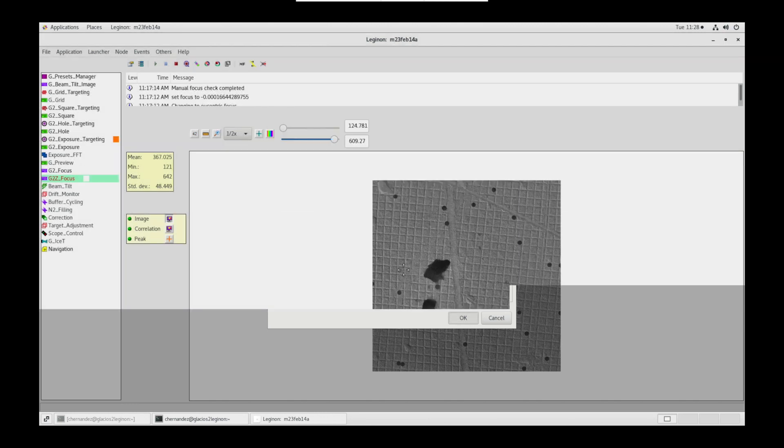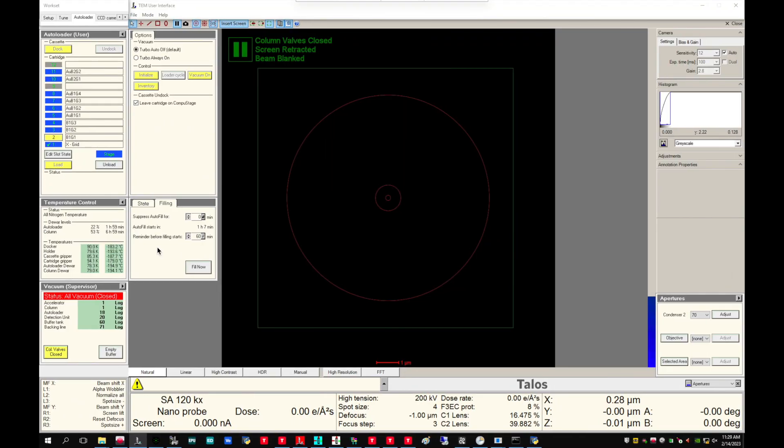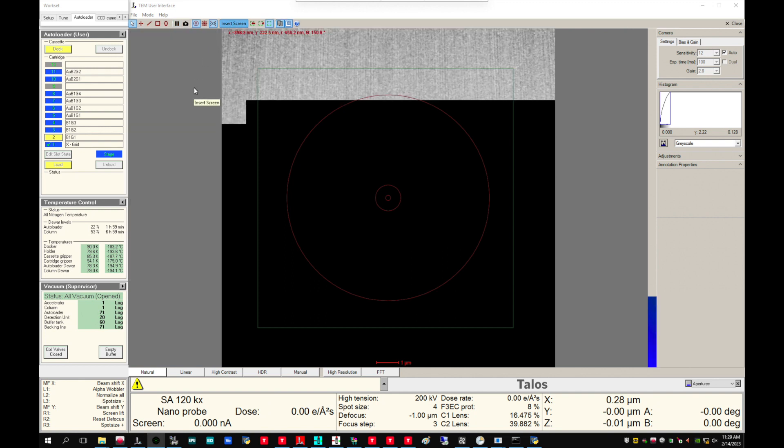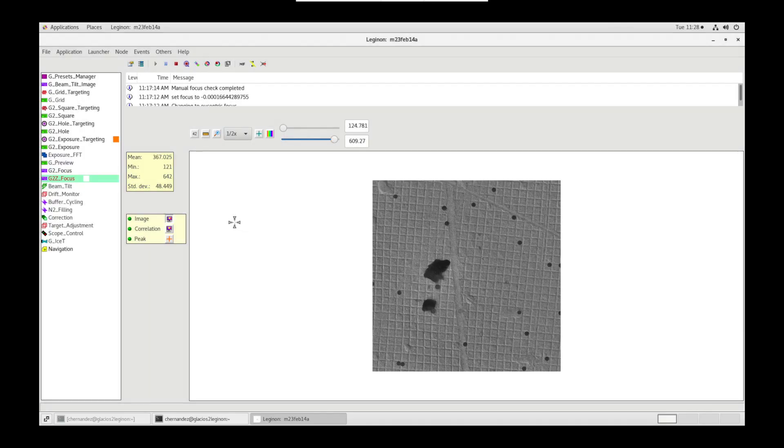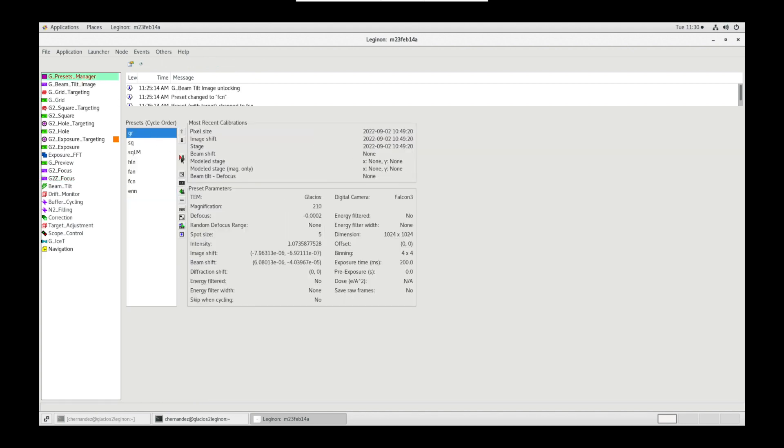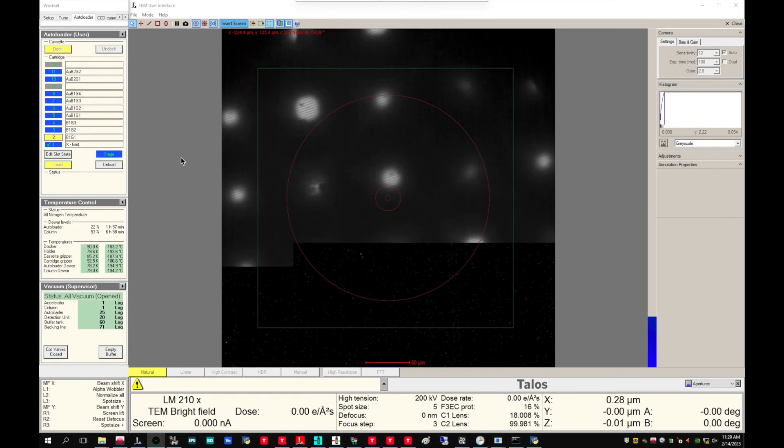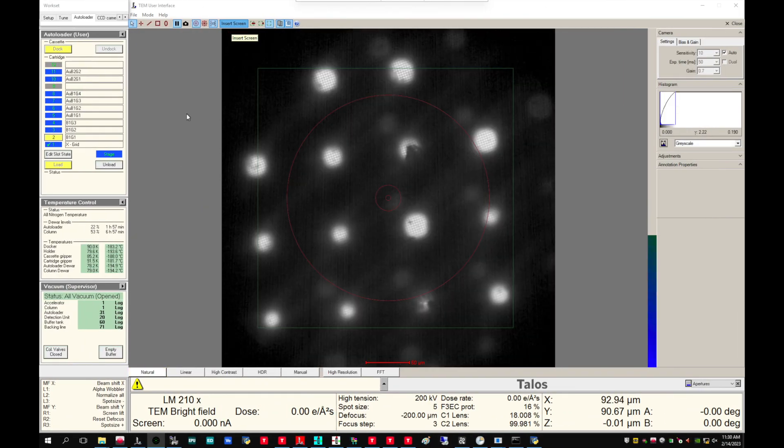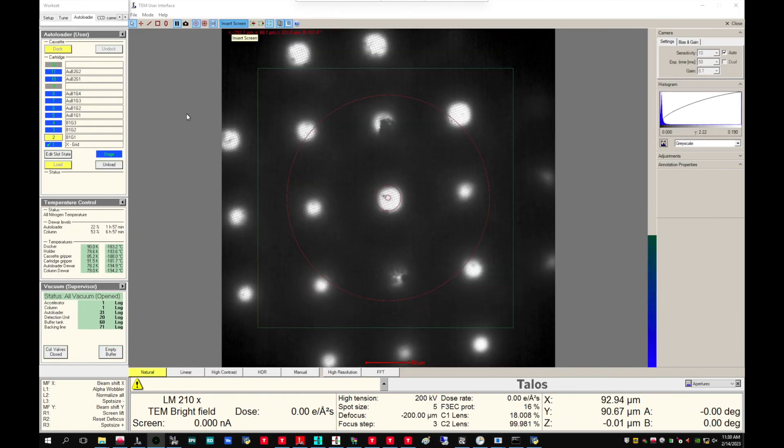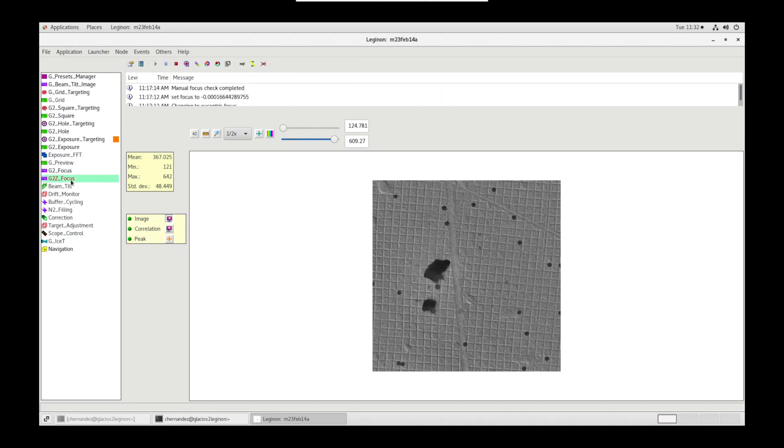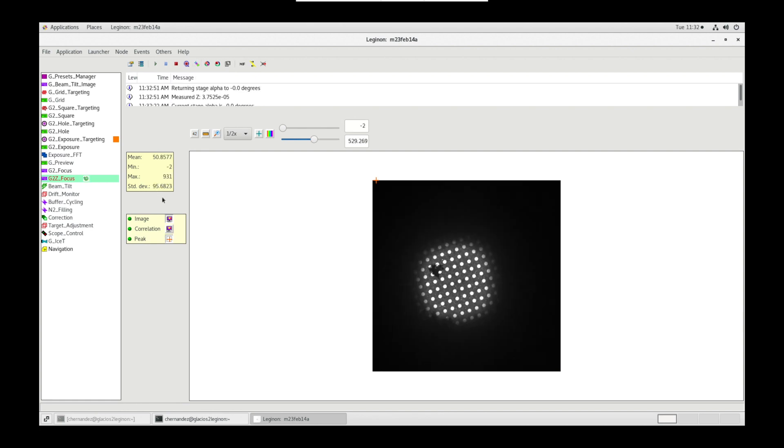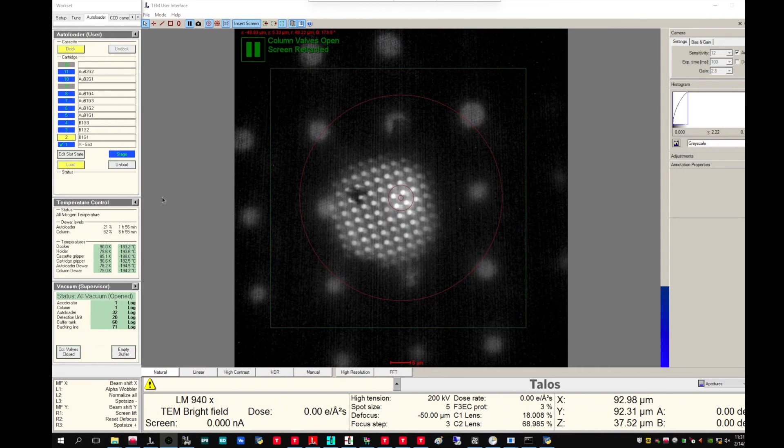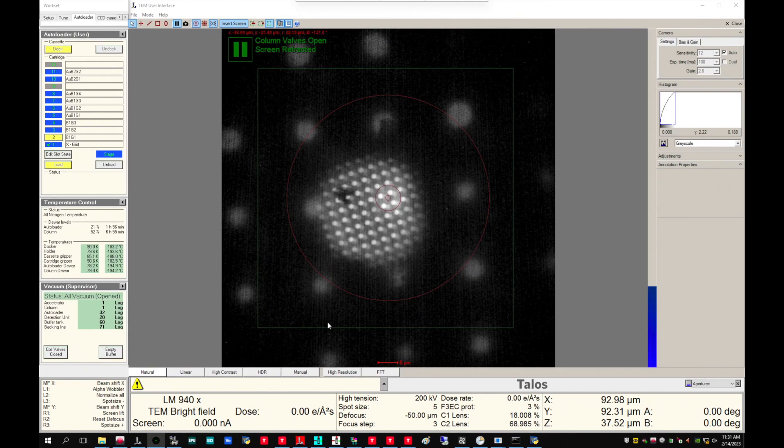Let's return to the microscope PC. Once the grid is loaded, open column valves and insert the flue screen. Back on Legenon, go to presets manager node and send GR grid preset to scope. On the microscope flue screen, the grid should be visible. Use stage movement to navigate to a fully intact square. In Legenon, in Z focus node, simulate a target. Once this is complete, the template will save this sea height for future grids.